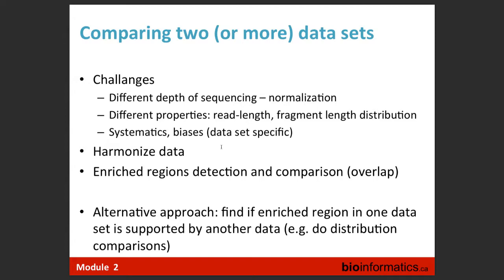An easy visualization of this would be the following. I have one H3K4me3 peak in one dataset, and maybe something like that in another dataset. Here I call a peak like that, in another I call a peak like that. If I overlap those, they say yes, they are concordant. If I look at the number of bases, I see that almost 30 or 40% are different. But if I actually look at the signal, I see the signal is very weak here. It's because somewhere my tool has to threshold my data. It's binary. It's a continuous signal which I'm binarizing, and I'm introducing those types of problems.